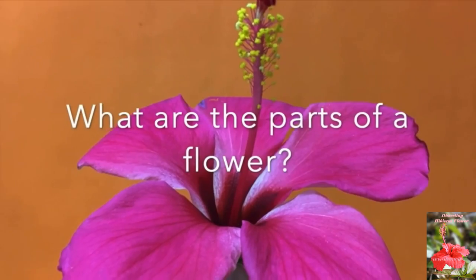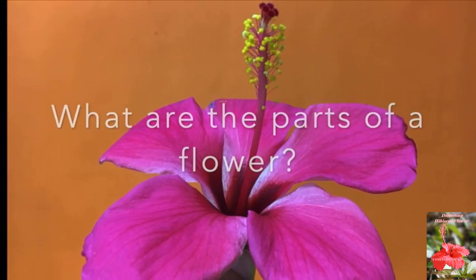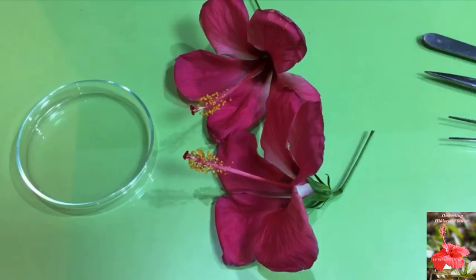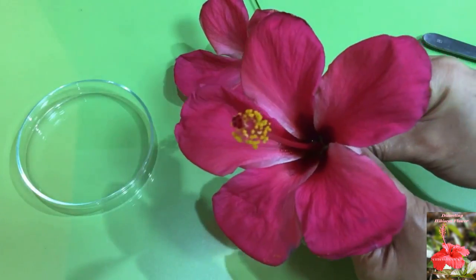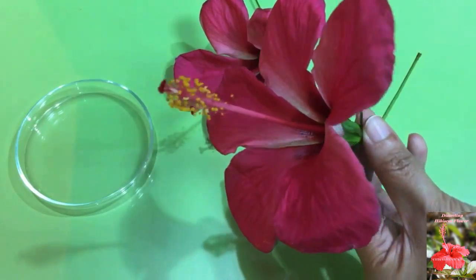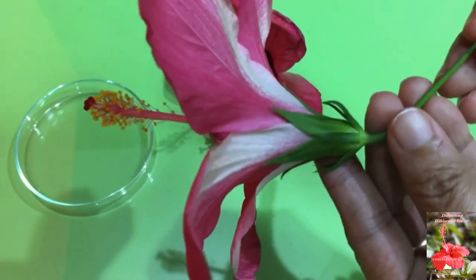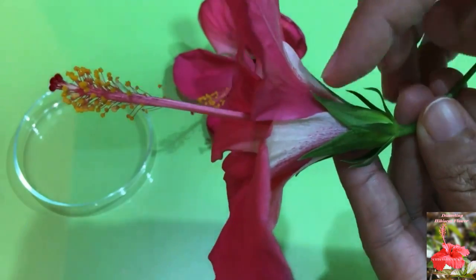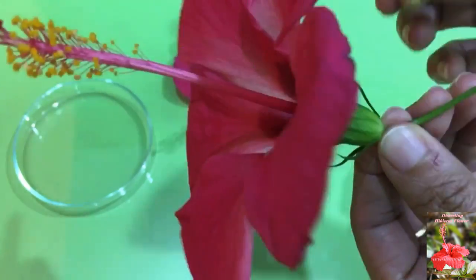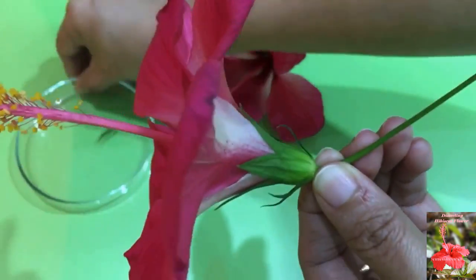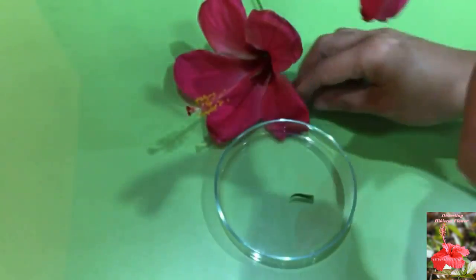But I will explain the parts of it. What are the parts of the flower? This is a hibiscus flower. Now we will start dissecting the flower.